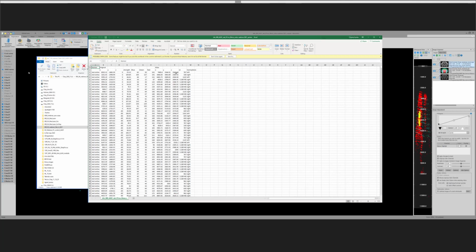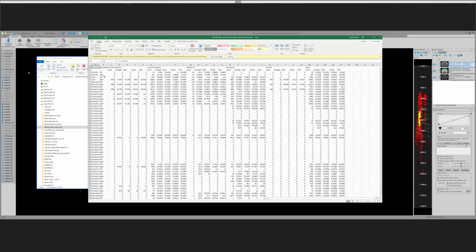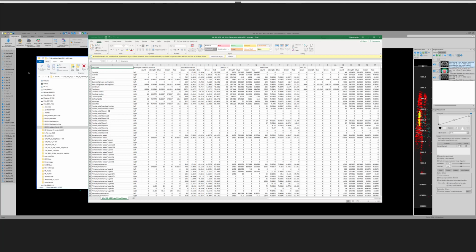This contains the coordinates of every cell, everything that's been marked in the brain. In the original brain, it gives the XYZ coordinates, and then in the registered atlas, it contains the coordinates in the registered framework.